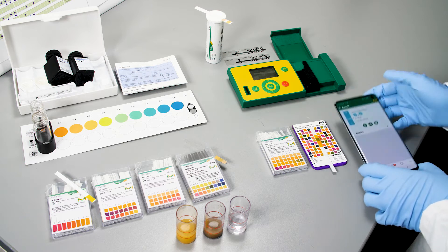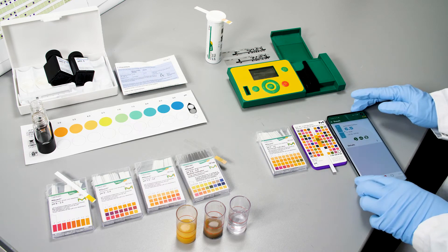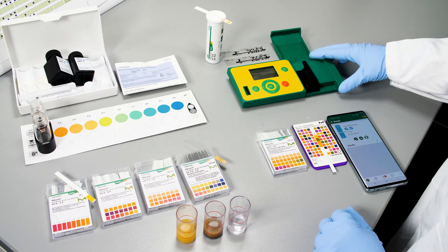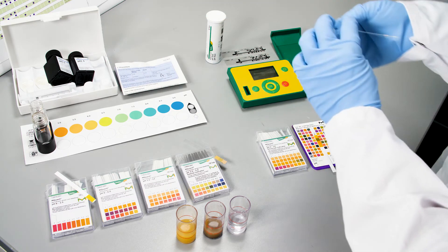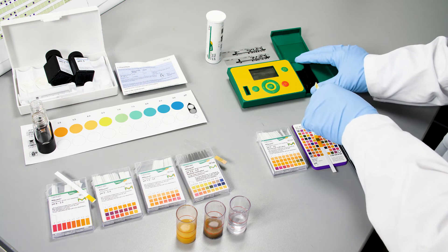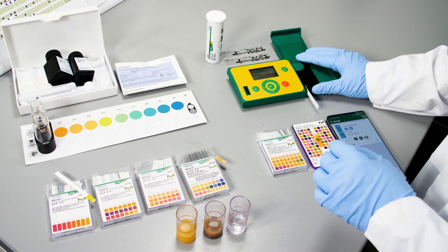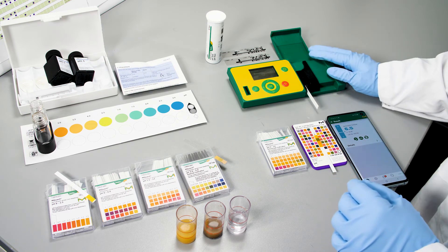The final option, if you really want results that are quantitative, you can choose the ArchiFlex 20 to perform pH measurements with Reflectoquant test strips. Just as with other Reflectoquant tests, you insert the test strips and the instrument will read out the result for you.